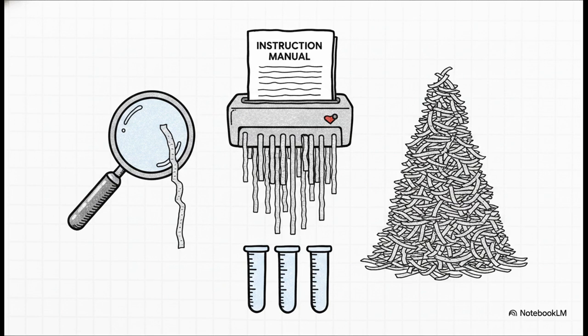We use a high-throughput platform like the Illumina HiSeq to scan those shreds. Now, our source notes some strict best practices here. You want a minimum read length of 50 base pairs. Think of a base pair as a single letter in the genetic alphabet, though 100 letters is much better.